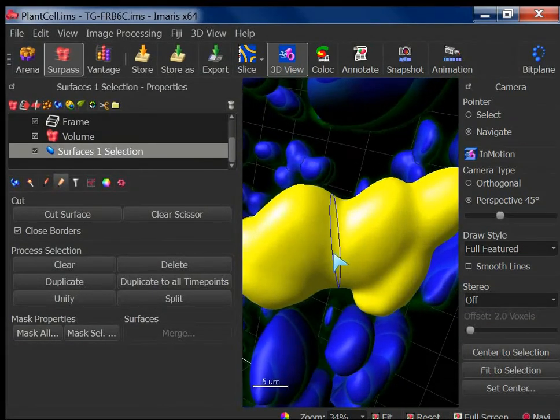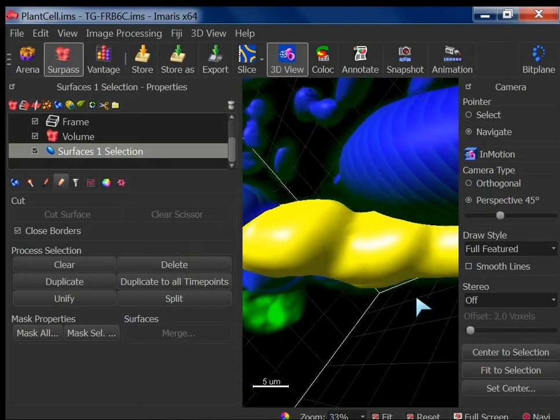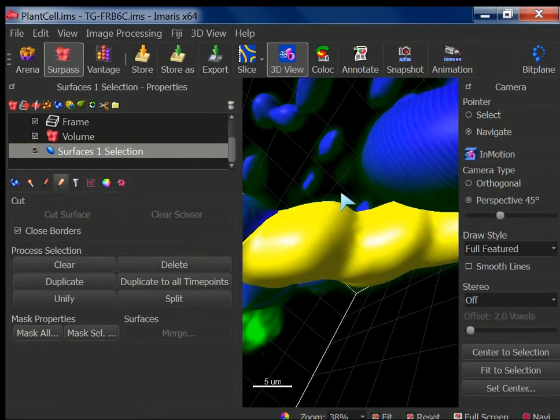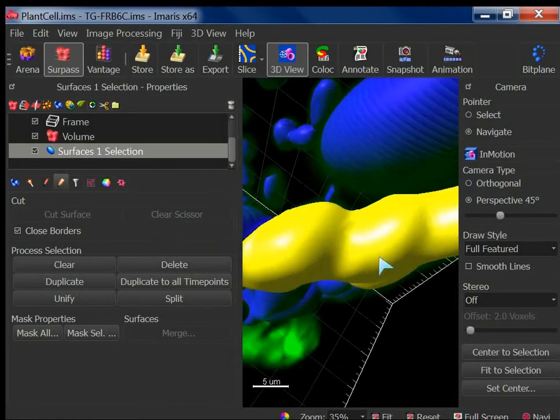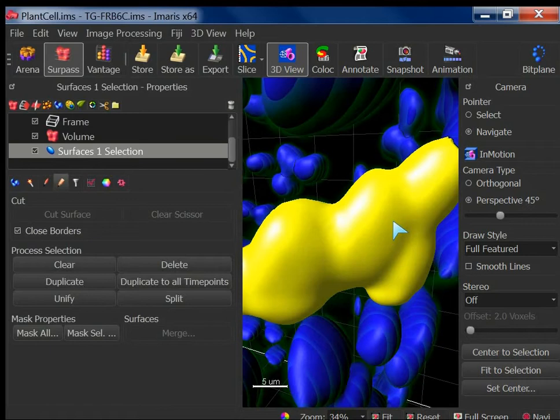Are you happy with that? Yes. If not, say clear CC and do it again. Change your orientation, because it all depends on the orientation of your object. Sometimes it will give you an error warning, meaning that at that particular visualization it is not possible to have a closed surface, right? So in that case, it will give you a warning. So let's try to generate such a warning. Maybe here. Well, it's possible to cut.